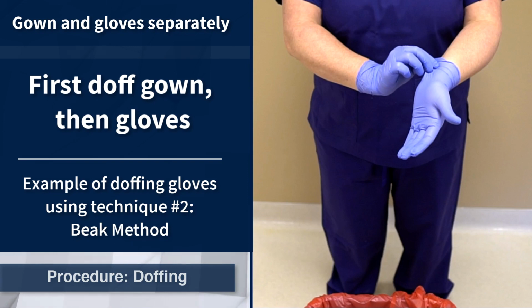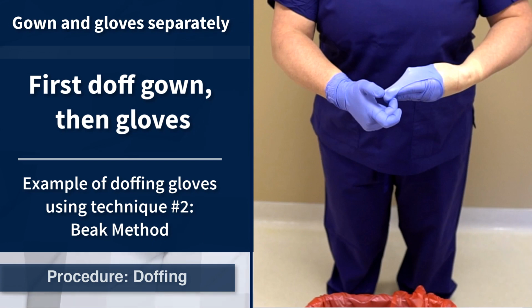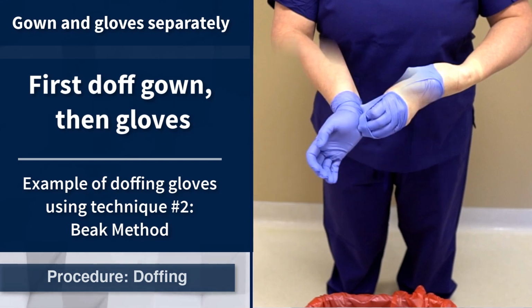Another method of glove removal is the beak method. Begin by pinching and pulling the wrist of one glove with a gloved hand, then, using a middle finger, scoop the cuff to pull the glove inside out and over the fingers and thumb to create a beak.